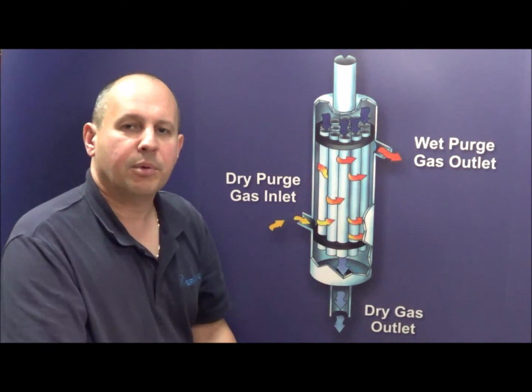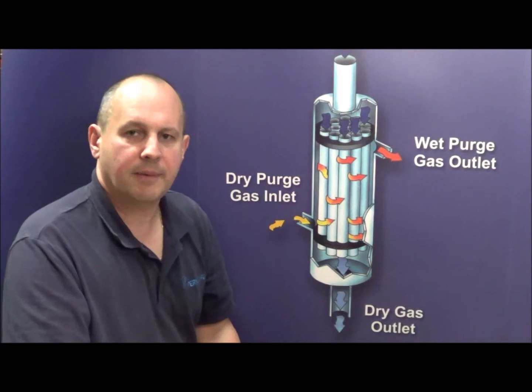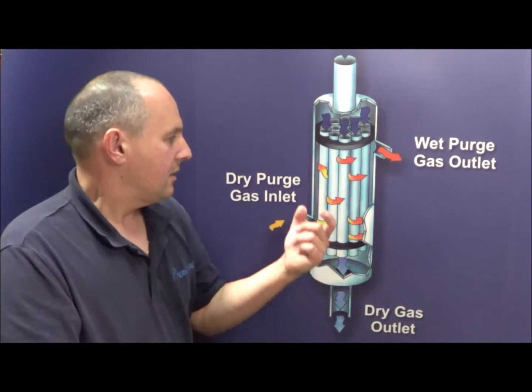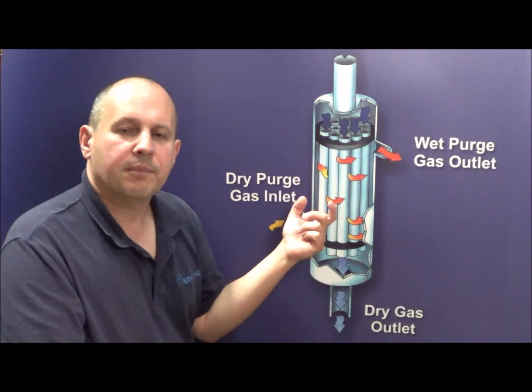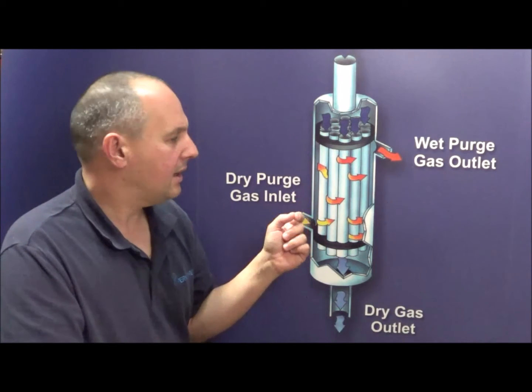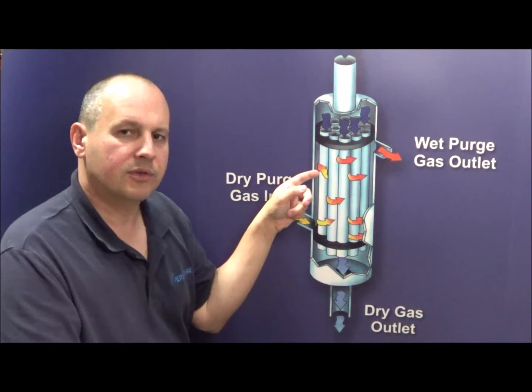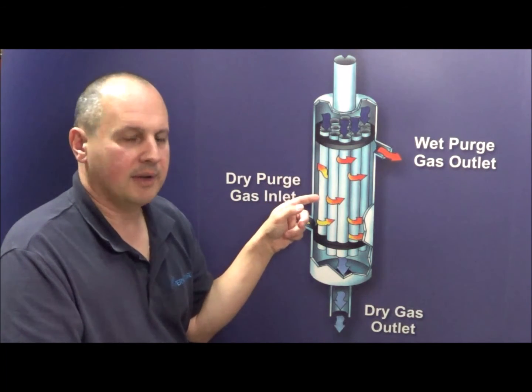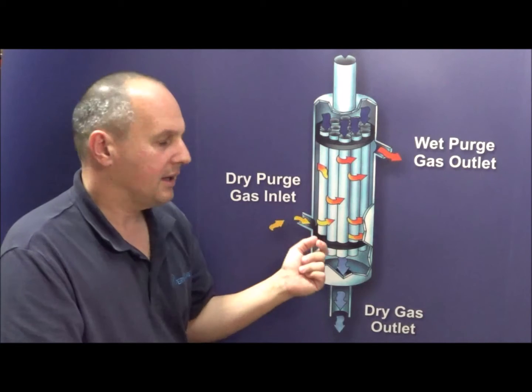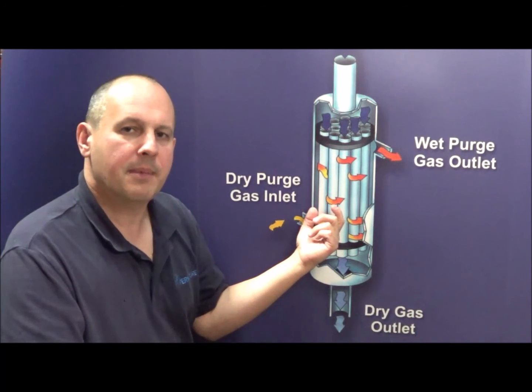Using the properties of the Nafion tubing and the tube's ability to transfer moisture through the membrane on the basis of relative vapor pressure, these dryers are made with a tube and shell design, where we can control the moisture of the gas being used to purge the sample gas. And that purge gas, in turn, extracts the moisture from the sample gas from the membrane.